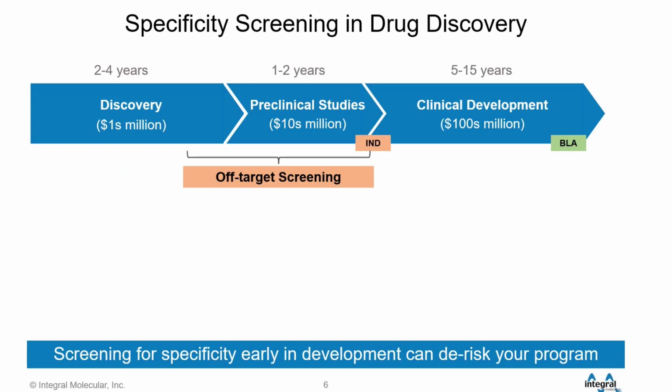Before I get into the technology itself, I want to talk a little bit about the general idea of specificity screening in drug discovery. Why is specificity testing important? We all know the huge amount of resources required to bring a drug to market, both in financial terms and the amount of time required. Since it is such an investment, more and more companies are thinking about ways to de-risk their programs earlier before clinical development so that poor or non-specific candidates can be replaced or engineered before too much time and money is invested in them.